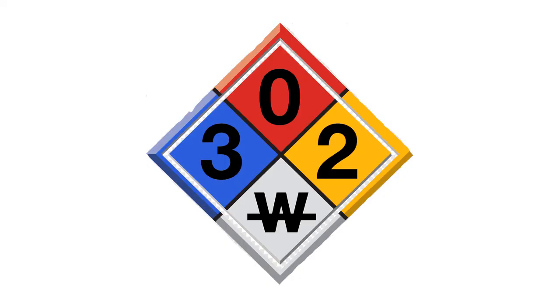NFPA hazard diamonds — not too bad, right? You've seen these around. Now hopefully when you get stuck behind a truck and see a hazard diamond for whatever it's carrying, you'll recognize what it means and what all those numbers mean. I hope that helps. Bye, y'all.